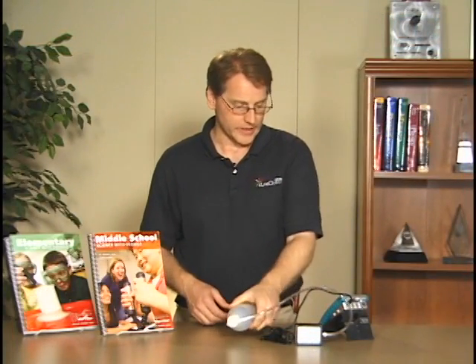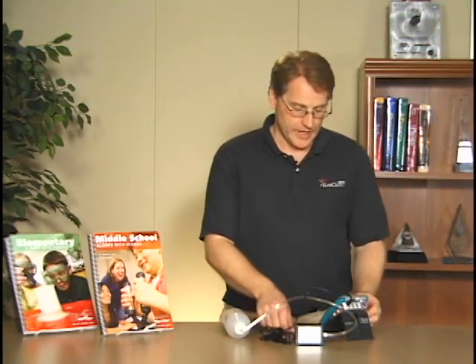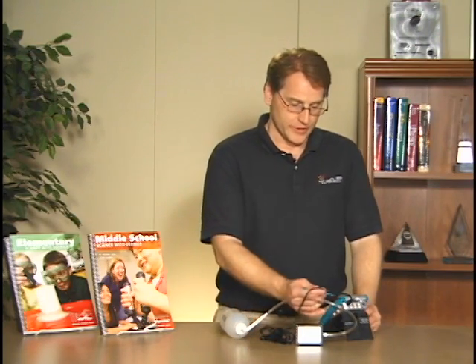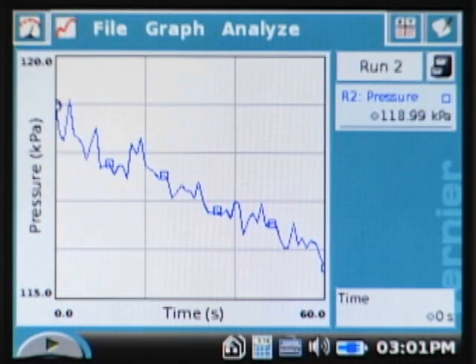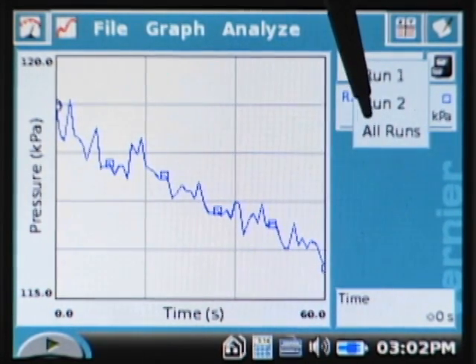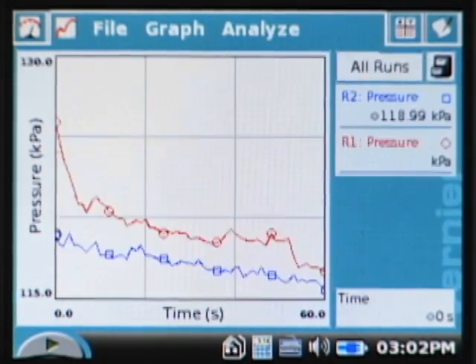Okay, so there's my second run. Now it would be nice to be able to see both runs together so that I can compare the values there. We can do that very easily by tapping here. You'll notice it says run two, and if I tap there it says run one, run two, or all runs. I will tap all runs, and then we see the two graphs displayed together—the red being my right hand and the blue my left.